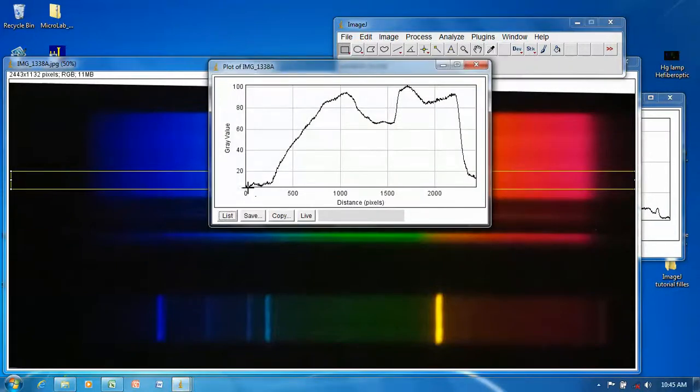And now we have the plot profile, the intensity. Again, out here we basically aren't seeing anything because we don't have any light gathering ability in the ultraviolet. And then we kind of see the absorption profile of everything, the vial, the water, I suppose the grating itself, and the paper. So this is our blank background that we'll be subtracting from our sample.